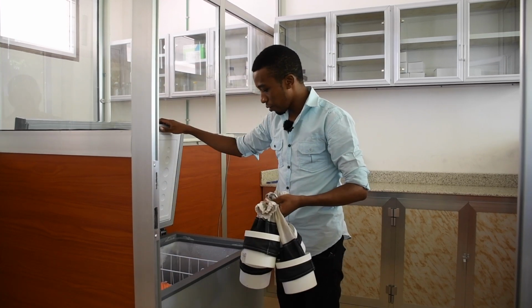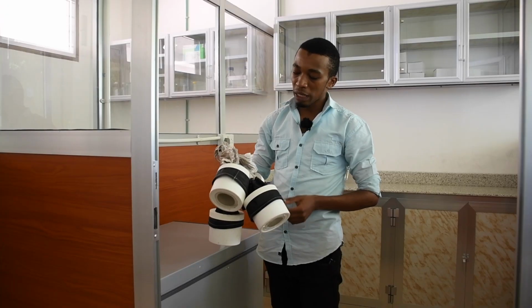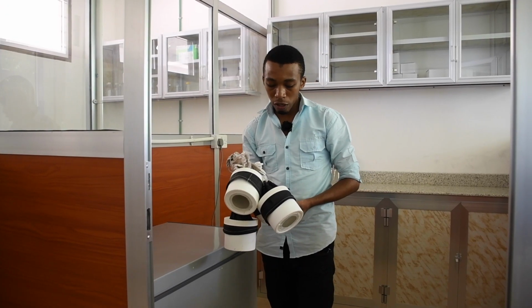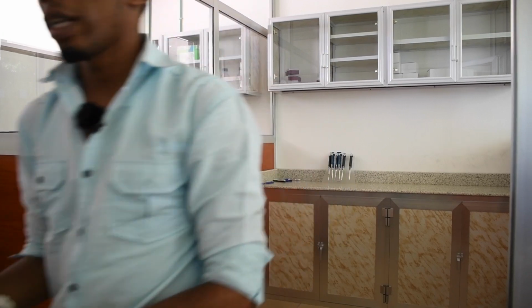Once we retrieve samples, we then identify the type of mosquitoes based on the species that we have collected from the different traps in the field. So we do the identification process under a microscope, which we can see right here.